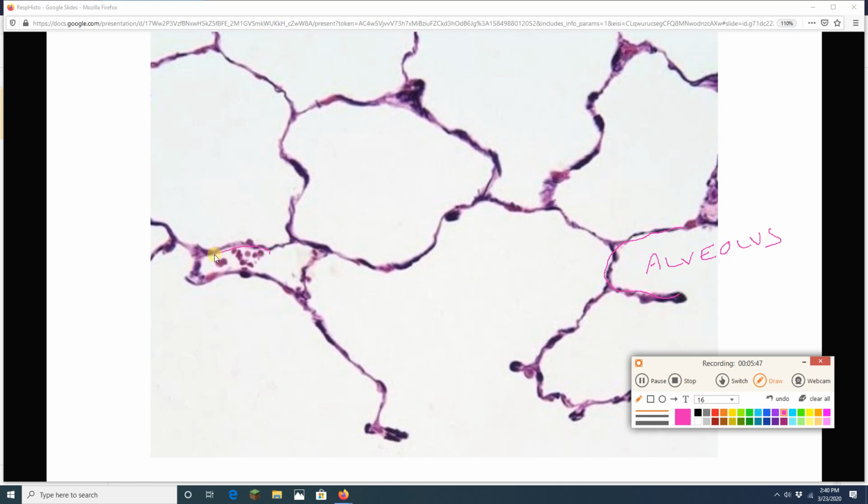We'll often find blood vessels, see little red blood cells there, associated with these alveoli. I said we'll often find, well, they're always there, we just don't always see them. The alveoli are made of simple squamous epithelial tissue. Simple squamous because it is super skinny, one tiny layer that is great for gas exchange.